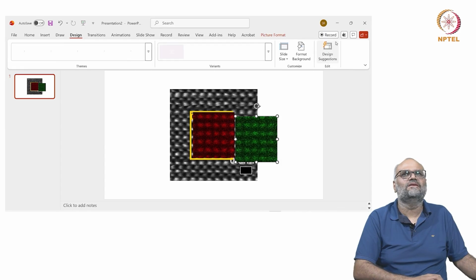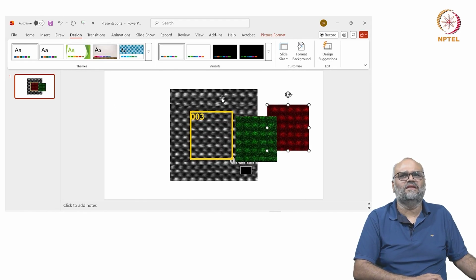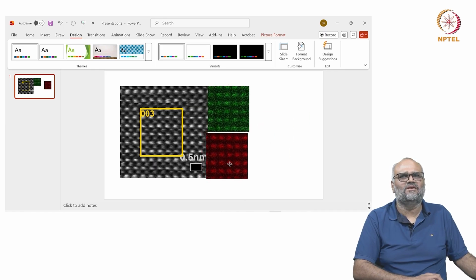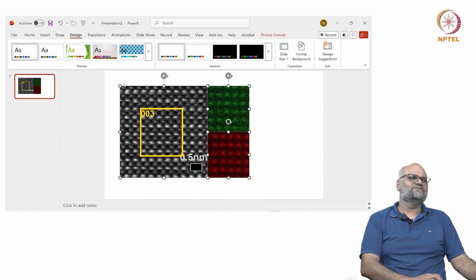I wonder why it pops up, but anyway. So I've seen most commonly publications where the figure is shown either like this, one below the other, with the elements being added, and you can then just save as a picture.